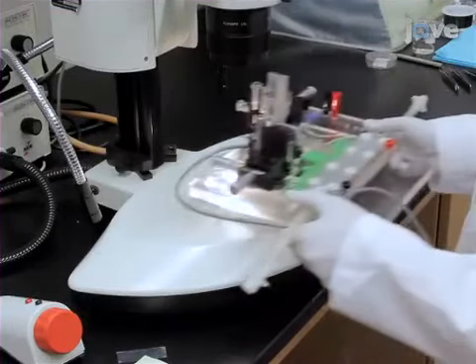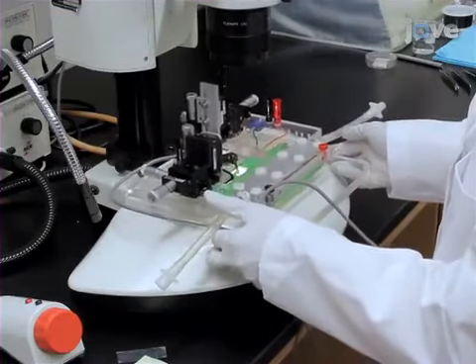First, place the testing apparatus on the stage of a stereo microscope. Next, connect the force transducer and length control.